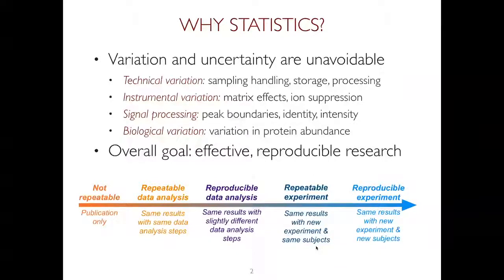And then also on the experiment side, we want to reproduce the same experiment. If you take the same biological material, we should be able to redo all the data acquisition steps and data analysis steps. We will not get the same numbers back, but we would want to have qualitatively the same conclusions. And of course, the gold standard for reproducibility is to take new biological material, new patients, or new samples, repeat conceptually the same type of data analysis, and get qualitatively the same conclusions.